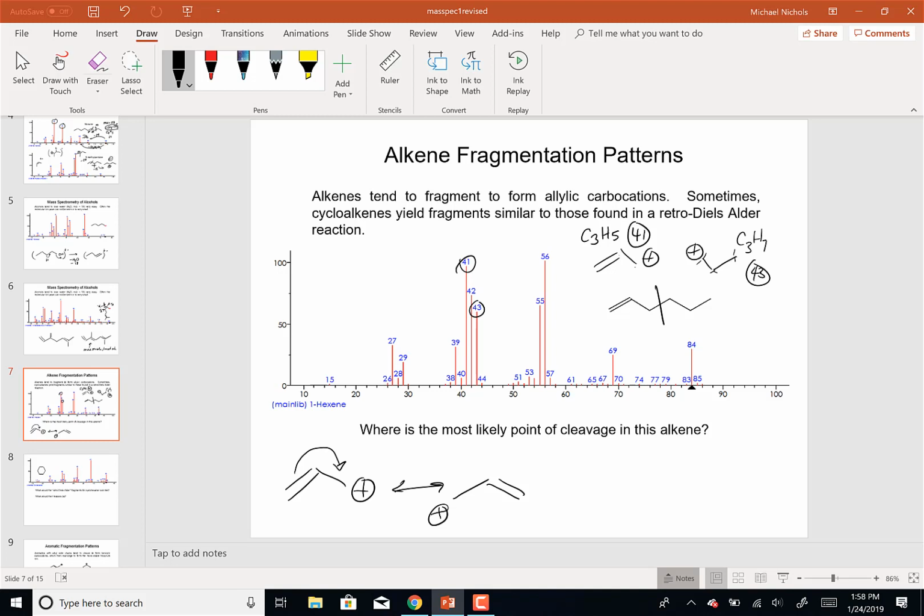So that's 41. That carbocation also one. Yeah, except we can't add fragments. We can only break up fragments. So we can never add mass to a fragment. We can only look at them. What about if that's the isotope? Yeah, it could. It might be. But we'd have to check that. That would be a good one.